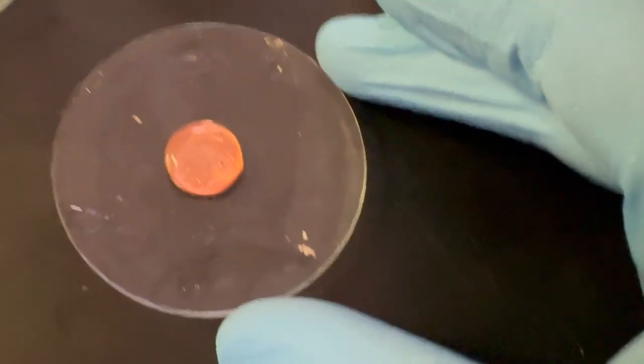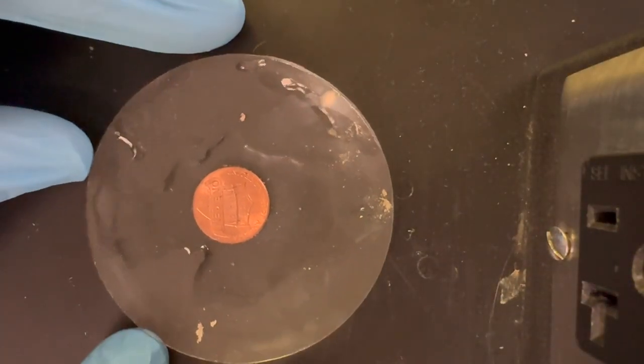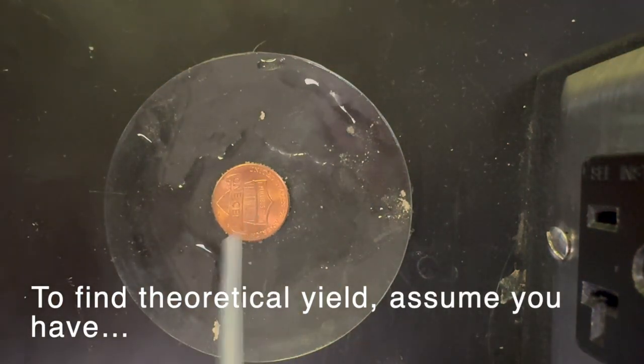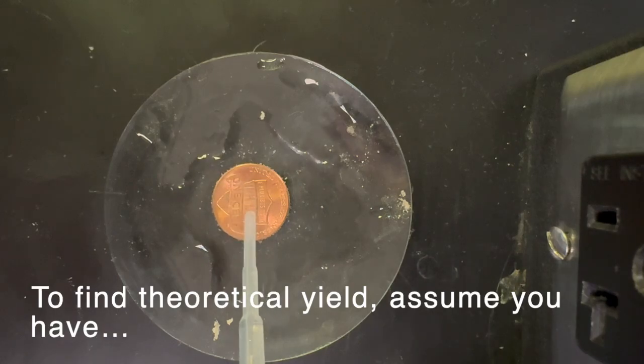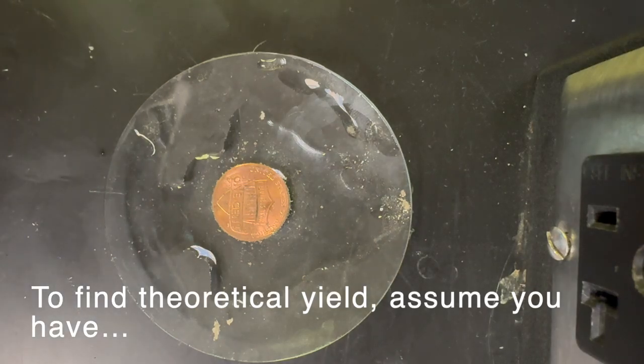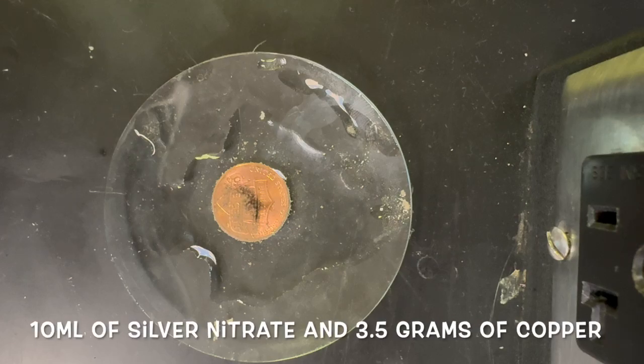Okay, so for this reaction right here, obviously we cannot react the entire penny, and so we're going to give you some theoretical numbers, and those are coming up shortly. Okay, and so for the silver nitrate, what you're going to do is run your math with 10 milliliters of silver nitrate. Now remember, to go from liters to moles you need to be in liters, so convert that 10 milliliters.